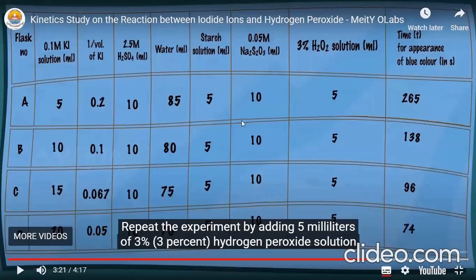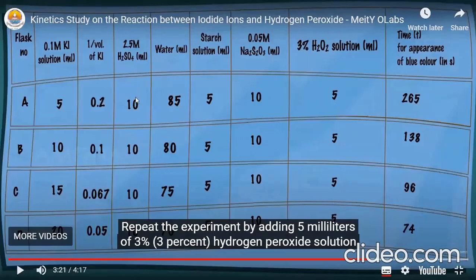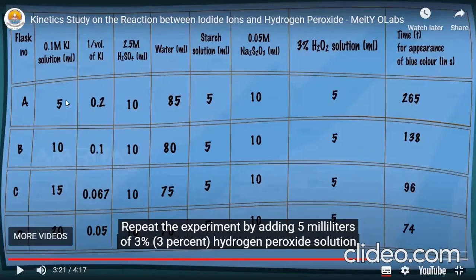After adding 5 ml of starch solution, we add 10 ml of 0.05 molar sodium thiosulphate solution to all flasks A, B, C, and D. Then we add 5 ml of 3% hydrogen peroxide solution to all flasks. We are adding sulfuric acid because the reaction must take place in acidic medium, and starch acts as the indicator. The reactants are potassium iodide and hydrogen peroxide.